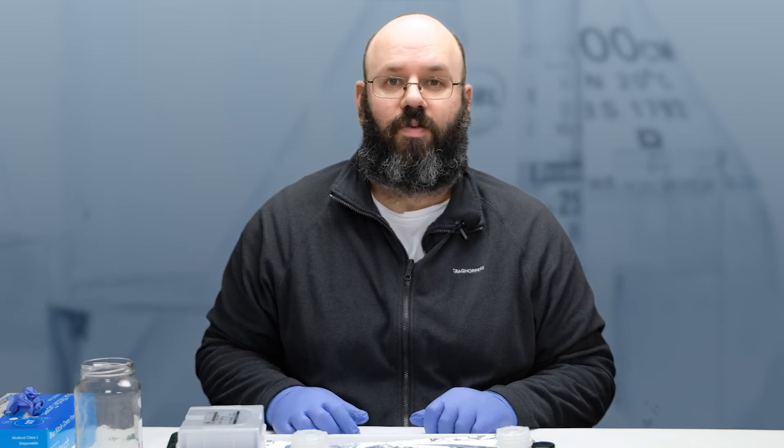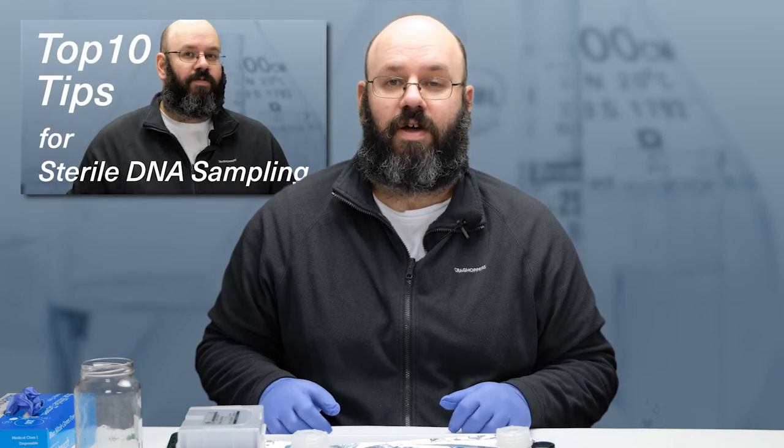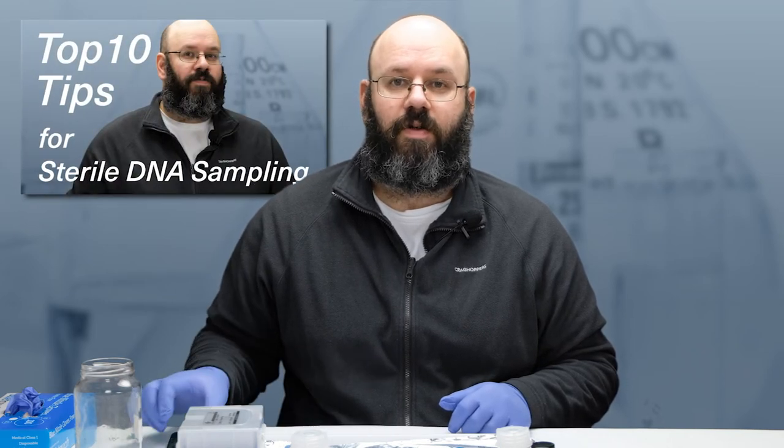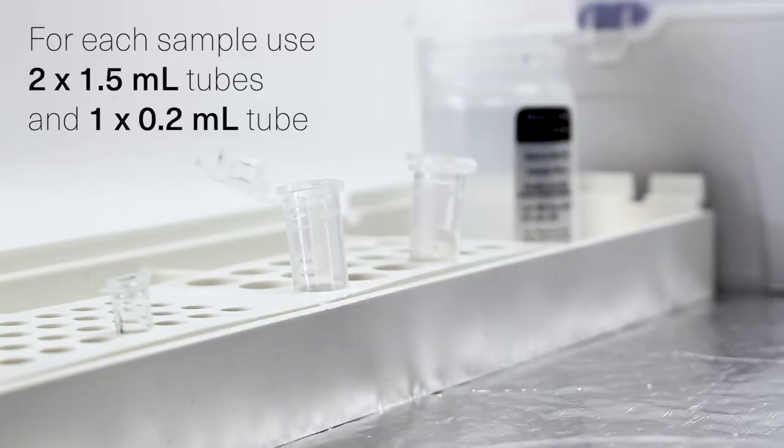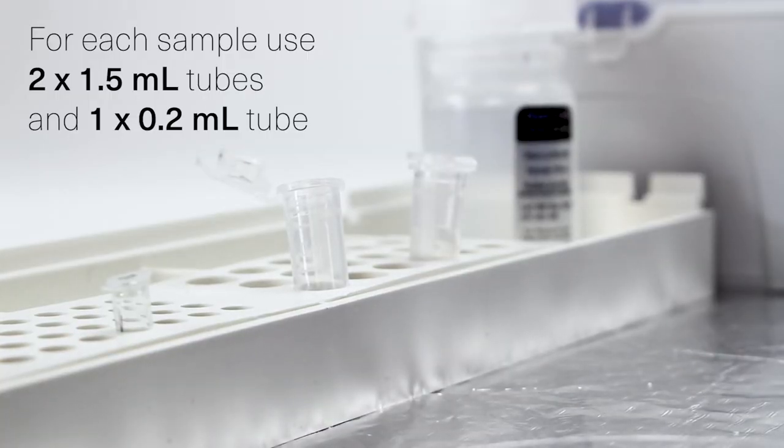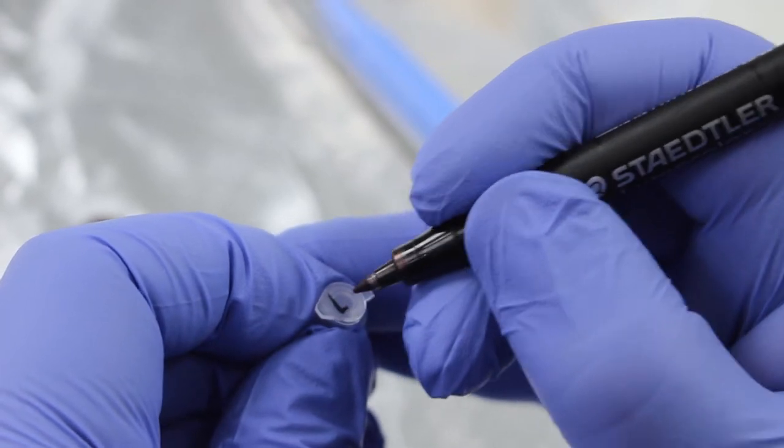First, make sure that your tools and your workspace are clean and sterile. If you want to know more about how to do this, take a look at our guide to clean sampling practices. For each sample, you'll be using two 1.5 mL tubes and a PCR tube. I've already labelled these tubes, and of course, labelling is very important if you're extracting multiple samples.